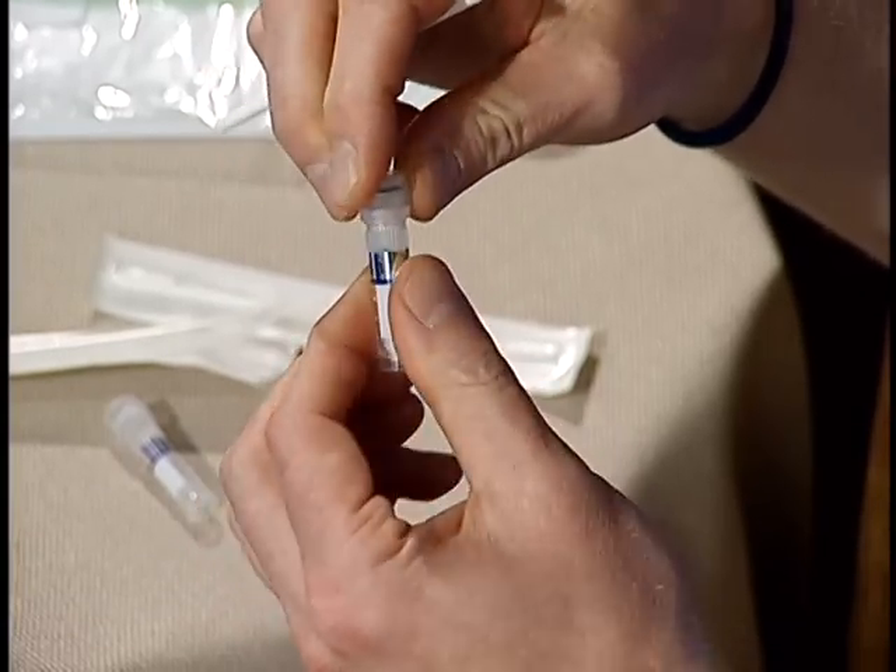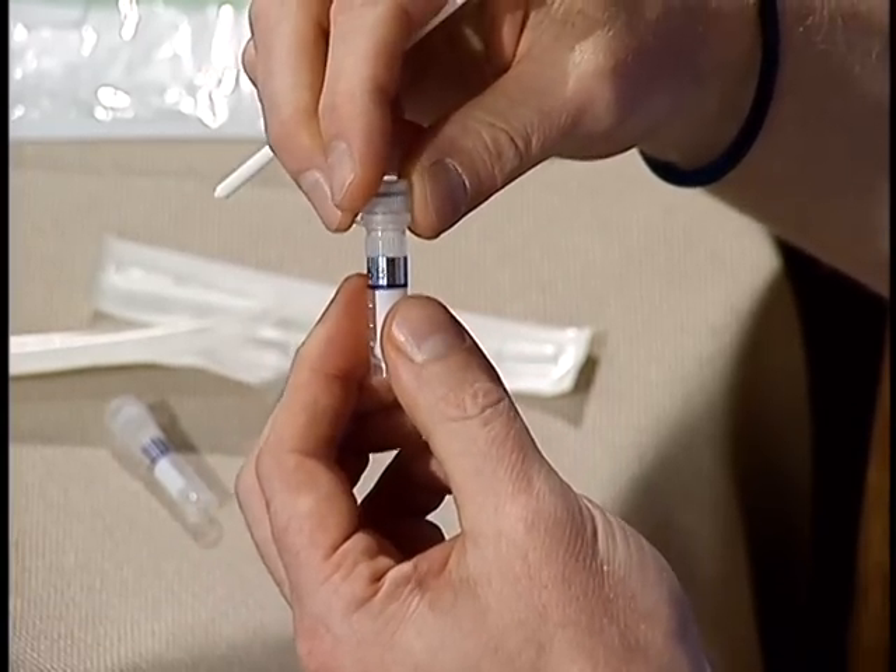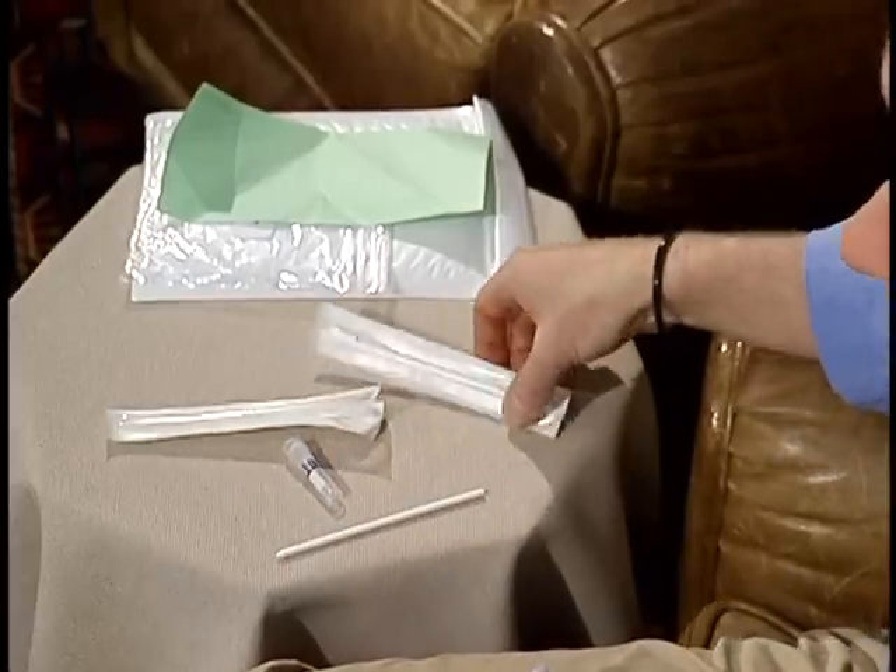Twist the cap onto the tube securely. The tube must be shut tightly to ensure the quality of your sample. The tube with the scraper tip inside should be left at room temperature. After eight hours, repeat the operation I just showed you, this time using the second scraper and the second tube marked with your kit number.